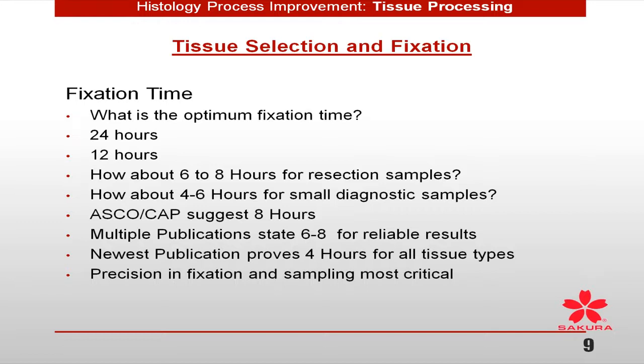I'm going to tell you, to have a diagnostic tissue sample, and being a long-term user of rapid processing for now almost 8 years with the high volume of samples going in there, 12 and 24 aren't absolutely necessary. There are minimum times that you have to look at. Once you get below a minimum time, you see a lot more variation. But once you get within a certain range, you're going to see less variation. You can create a diagnostic consistent sample in less than 12 hours, in less than 8 hours of sampling.